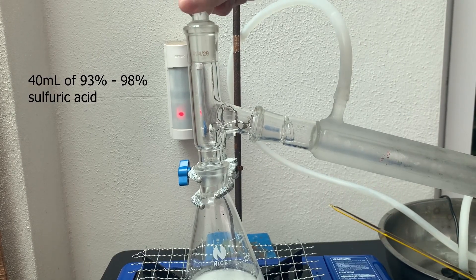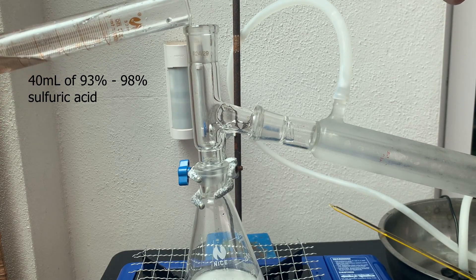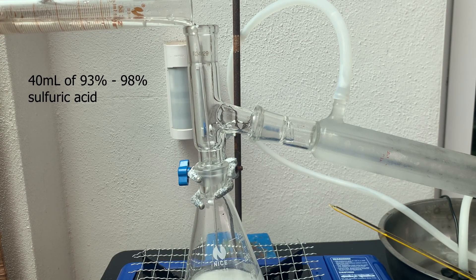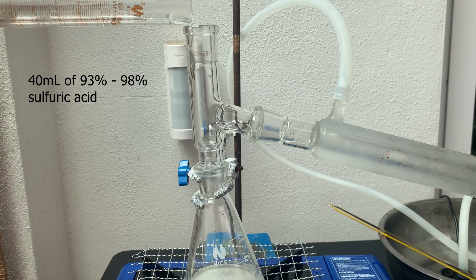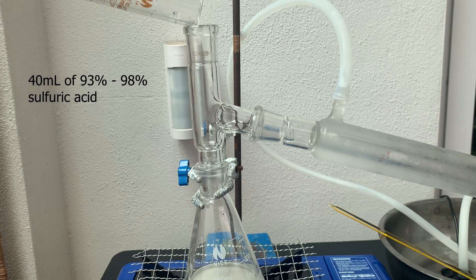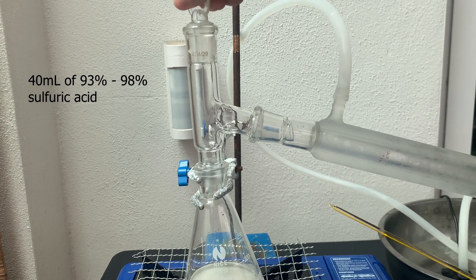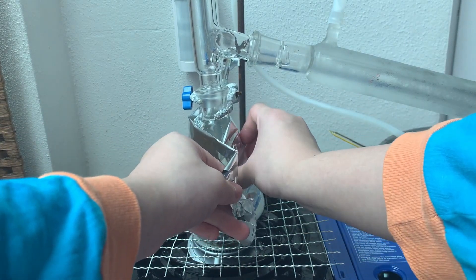To start the next step, I firstly set up a simple distillation and then added 40 mL of concentrated sulfuric acid through the three-way adapter. I also added ice to the condenser water so that it is at a constant temperature of 14°C. I also insulated the Erlenmeyer flask with some aluminum foil.